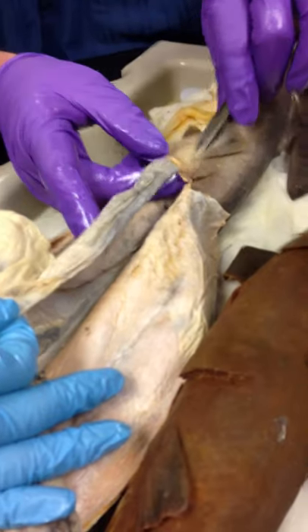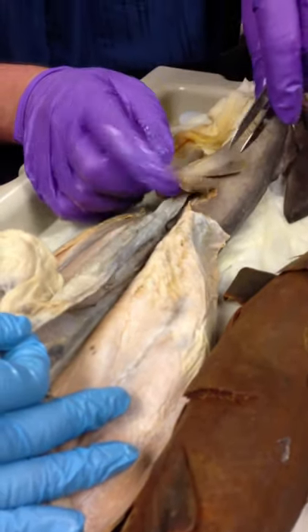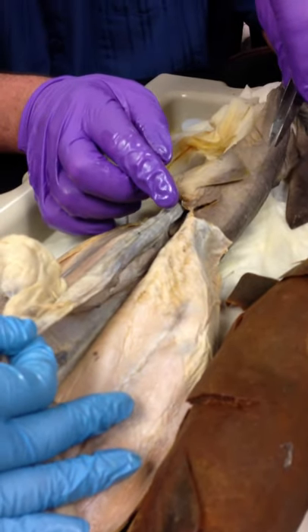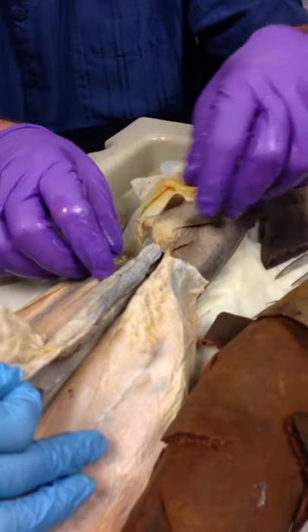And on the outside, it's probably, what, 8 inches, maybe a foot? Maybe a foot? No, it's not. It's an 8-inch long intestine, but on the inside, it might be a foot and a half because that food is forced to go around in a circular pattern. There's no straight line through this.